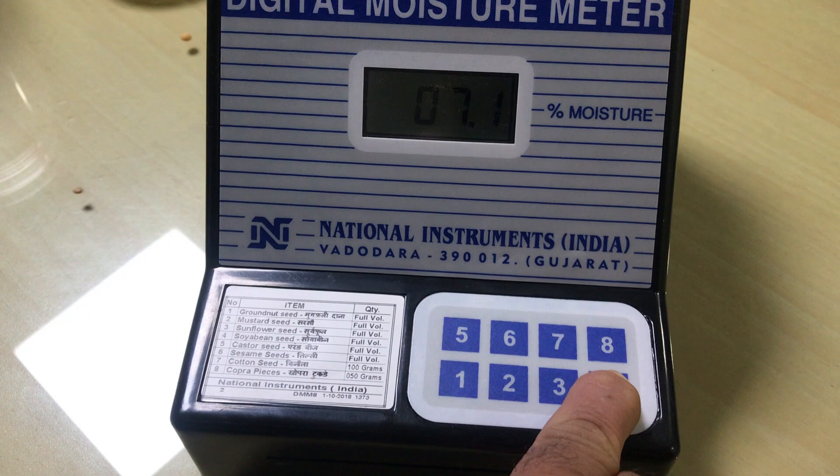It indicates the percentage moisture in soya bean seed. It is 7.1% moisture. This is quite dry soya bean.